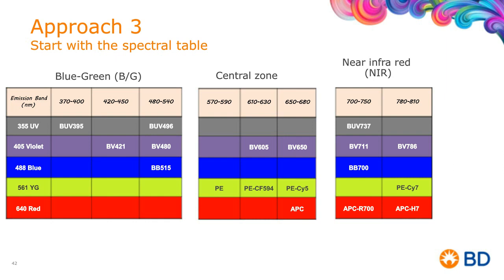Now, for everyone on this line, in all the many panels that I've made in the higher dimensional space, I use what Andrew shared with me. And I see great consistency in panel design. I'm not saying it's better than others, but it makes a lot of sense to me with the fundamentals that we have here. So what he does first is he begins placing the long wavelengths on the specificities at the top of the biological tree. So he takes advantage of all of those at the very end of the laser lines.